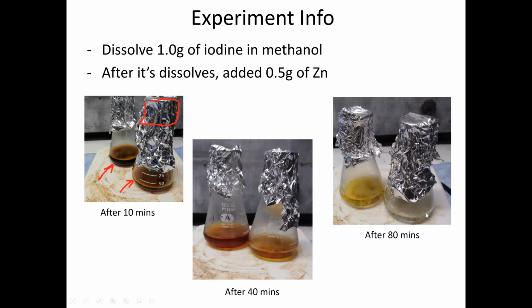So what I'm trying to show you here is that this process takes a long time. And so you want to go ahead and get your reaction going, because it's going to take at least an hour to an hour and a half for you to get to that point of colorless. And you want it to be colorless because that way you know that all the iodine is consumed. So your starting solution is a dark brown. Your end solution is a colorless solution.